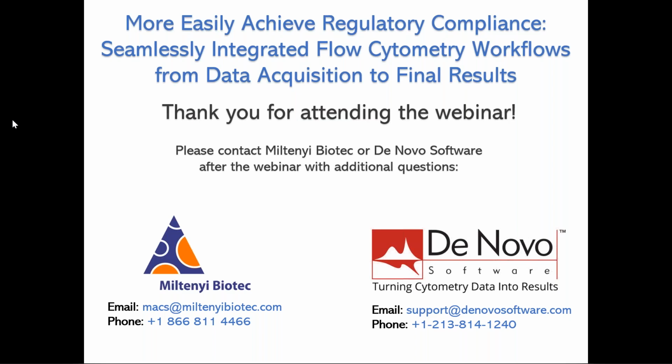The way I'm interpreting that question is that you've created your settings on your donor instrument, and there's, let's say, a group in another department, and they're working on their settings, and they've made some improvements. From that point, if you've improved the settings, then you do have the ability to take those settings back to the donor instrument. The donor designation is just designed to identify the unit that maybe the R&D group was working on, or some other group, and they decided that these settings are absolutely perfect for us.